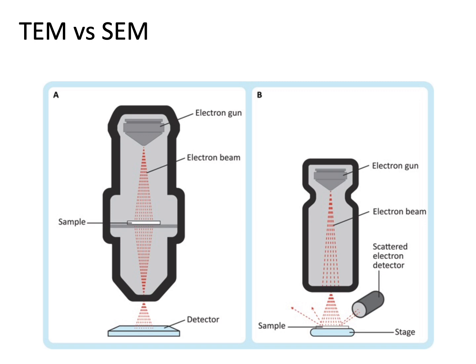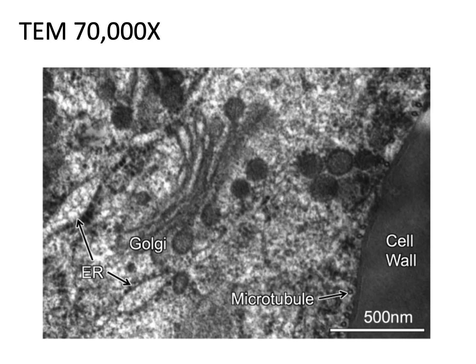Whereas electrons that struck a side of the cone and ricocheted off directly into a detector would be super bright, and that would be reflected with your detector as an intense area. Whereas ones off to the side might go towards a detector but might not hit it head on, would give kind of a grayscale or intermediate signal. So it's the way that those electrons are scattering and being detected that gives information on the shape of something.